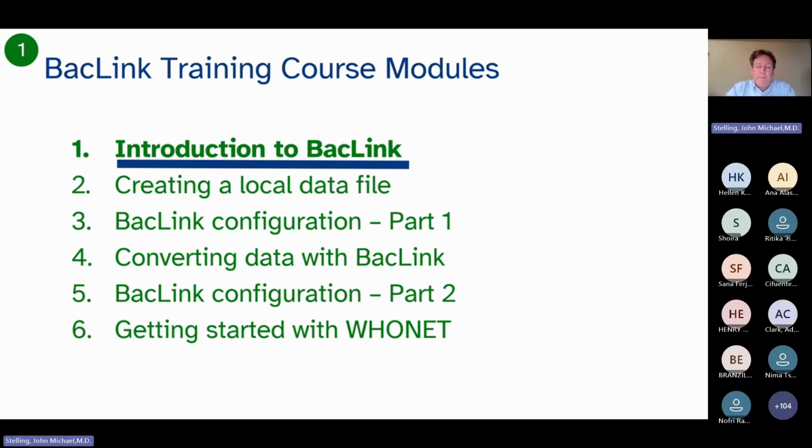I guess one could describe it as some of the more advanced features that many of you will not need, but some of you will need. Once you finish with BacLink, then you can get started with WHONET.